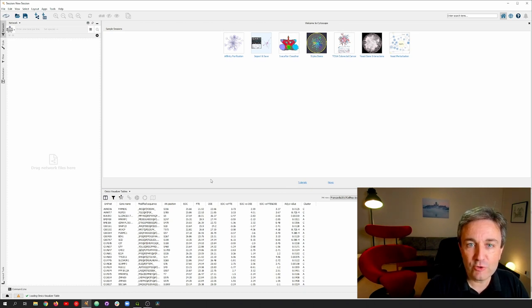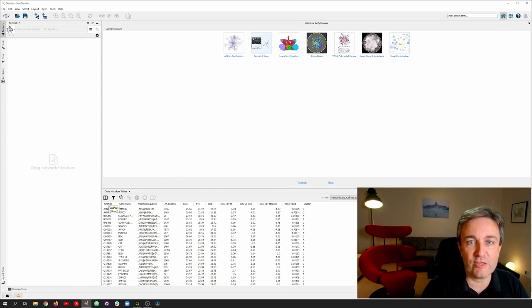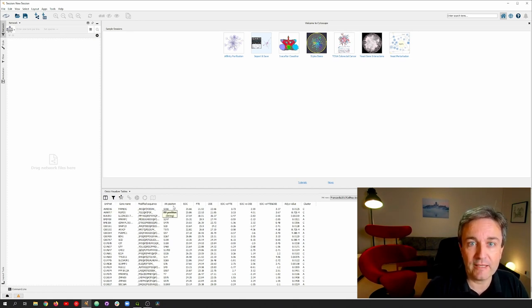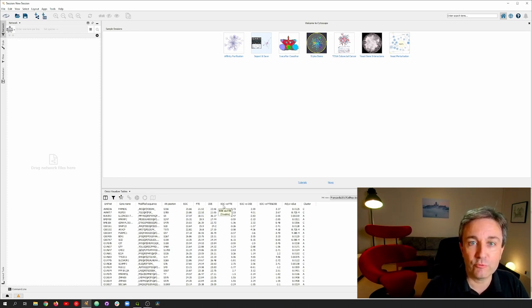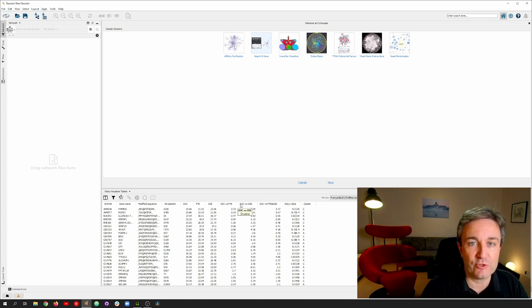As you can see, the table has many columns, including the UniProt accession numbers of the proteins, the modified residue numbers—that is the phosphorylated residues—and two different log fold change values, representing two different pairwise comparisons of the three conditions.